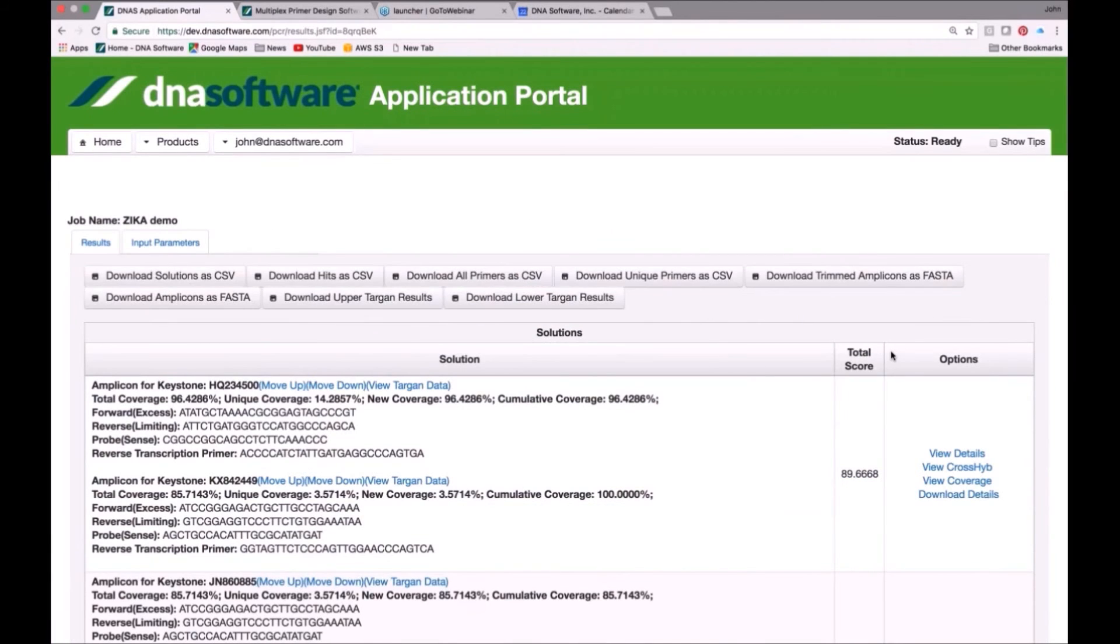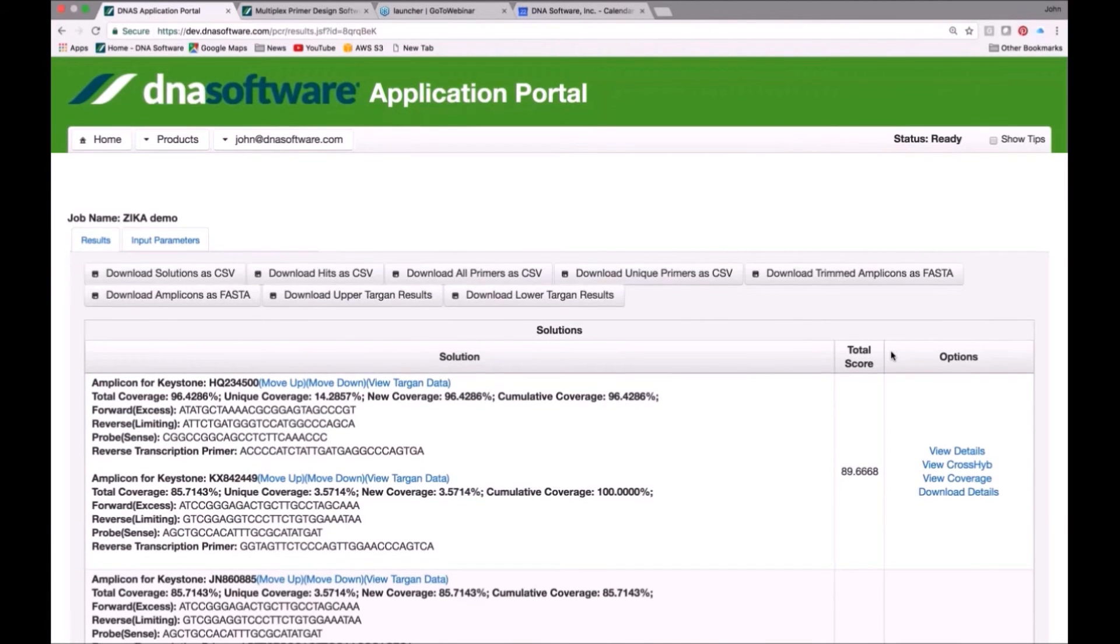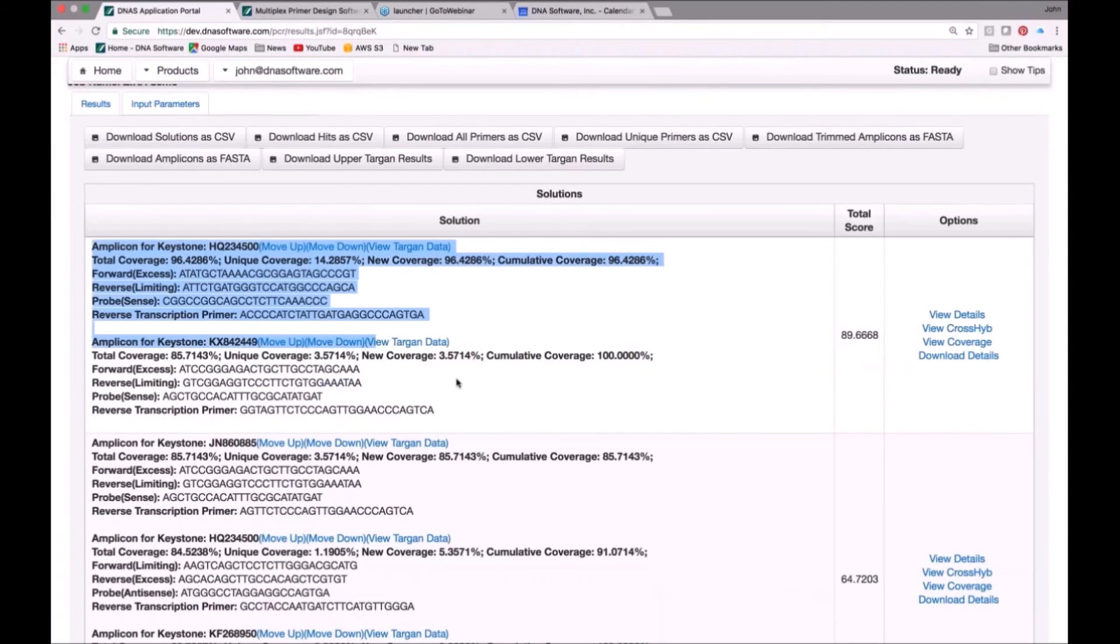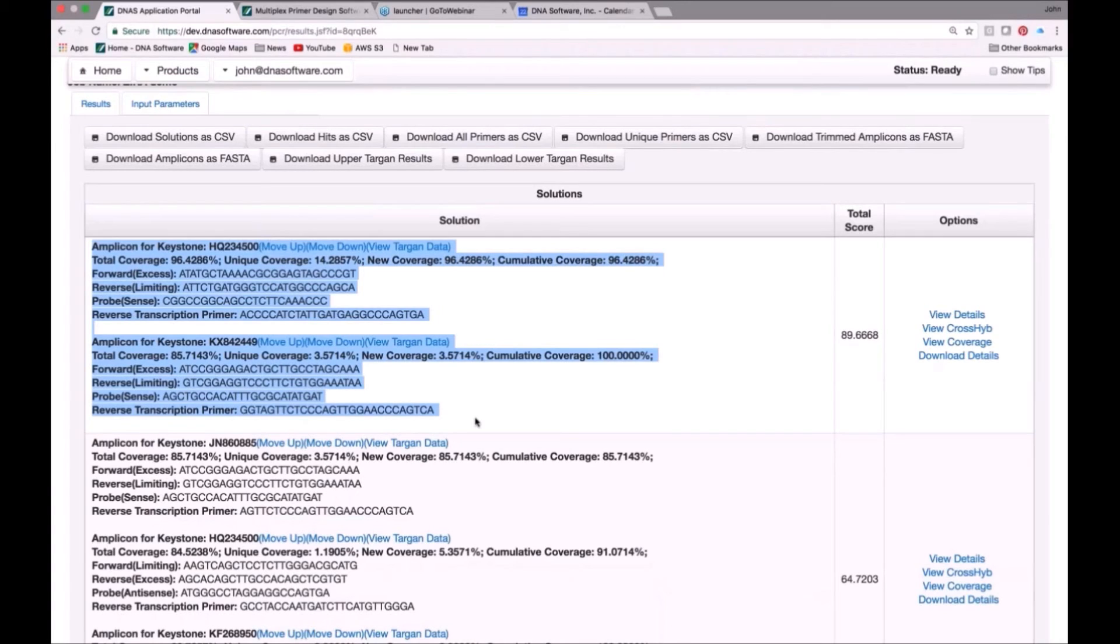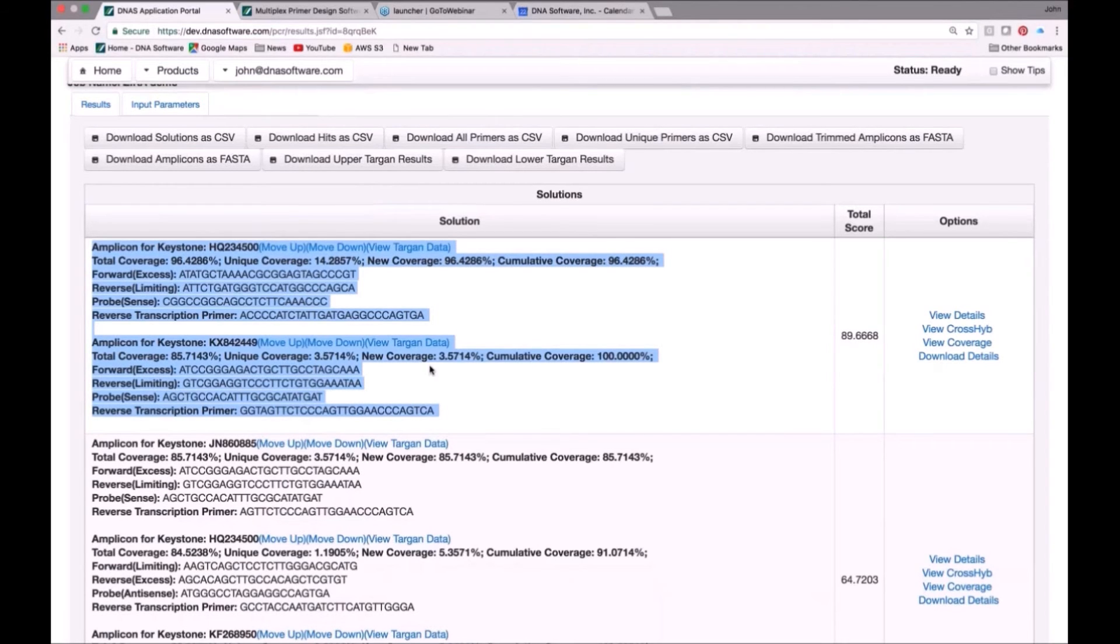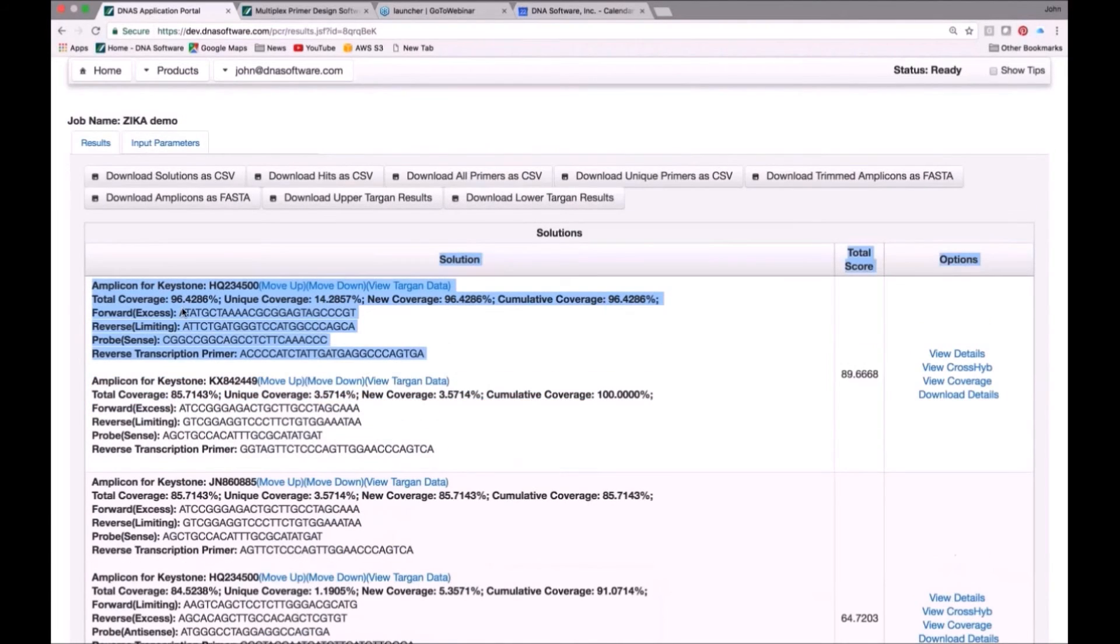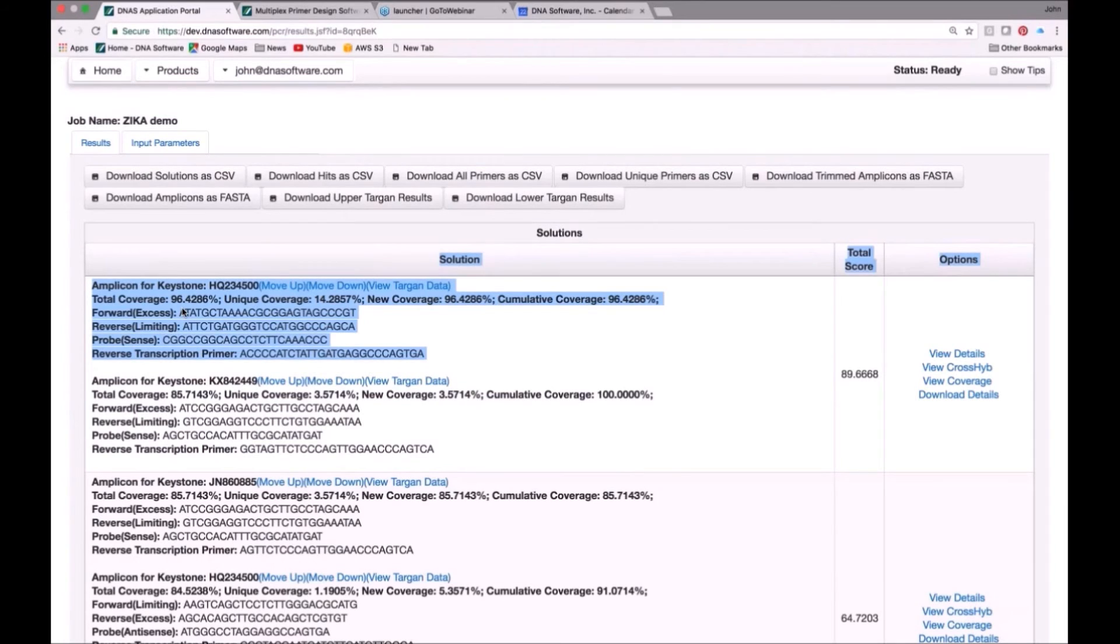We can see here that the first solution it found involved two primer sets, and I'll highlight them here. Here are the two primer sets that it used to cover all 168 different sequences. And you can see, individually, the first set of primers, which I'll highlight. This first set of primers was able to cover 96% of the Zika variant. And you can go in. The software does show you what those variants are that were covered by that primer set.